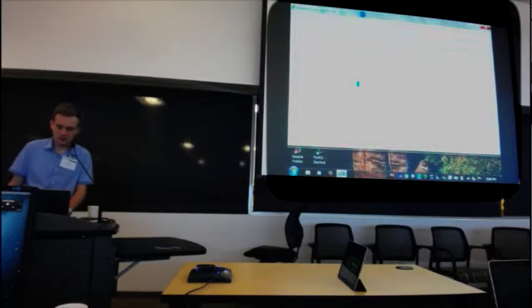It's this one. I didn't want to go into that because it's very long and complicated. It contains all of the parameters that we can tweak. And the one that is responsible for hit finding is this one, called post-processor. The post-processor number is 208.